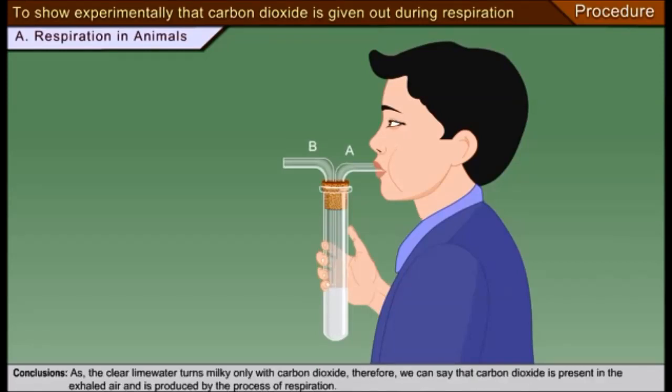Conclusions: as the clear lime water turns milky only with carbon dioxide, therefore, we can say that carbon dioxide is present in the exhaled air and is produced by the process of respiration.